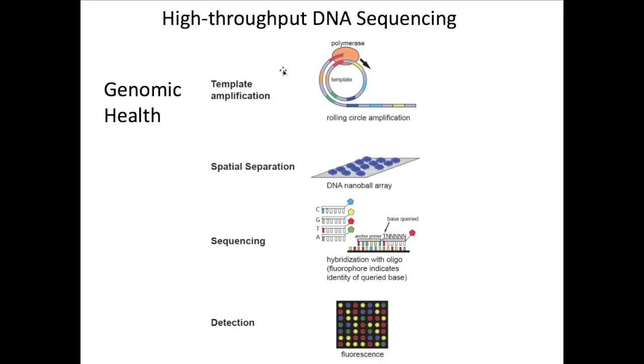Suffice it to say that by a combination of doing targeted ligations of the DNA that you want to sequence, and then using restriction enzymes that cut a certain distance away from a known linker sequence that you attach to the DNA, you generate a sequence of tags, which I'm labeling here as colored segments, and you end up with a circular molecule that's got lots of these little tags that you're going to sequence subsequently.